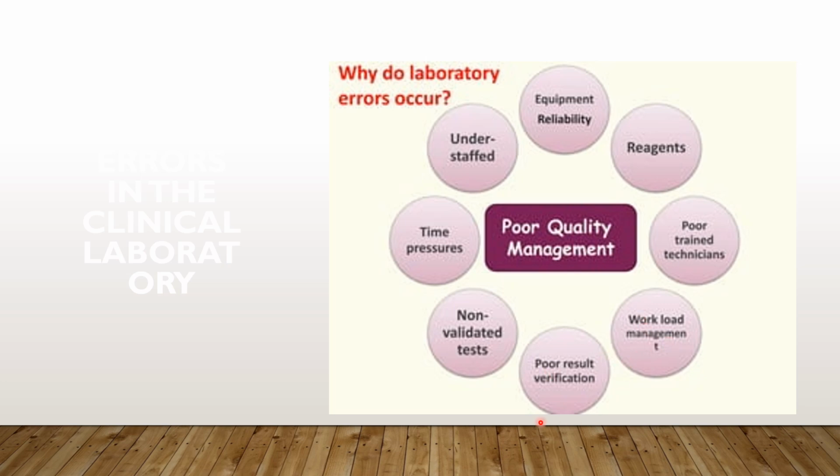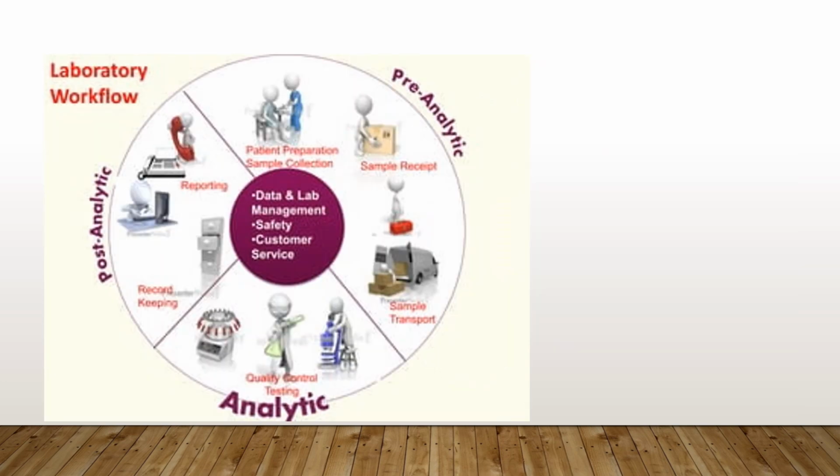Then poor result verification, where results are not properly verified and cross verified, may also be a reason. Then non-validated tests, where tests are done via a non-validated method, may also lead to errors. Then time pressure and work pressure are another cause of laboratory errors.